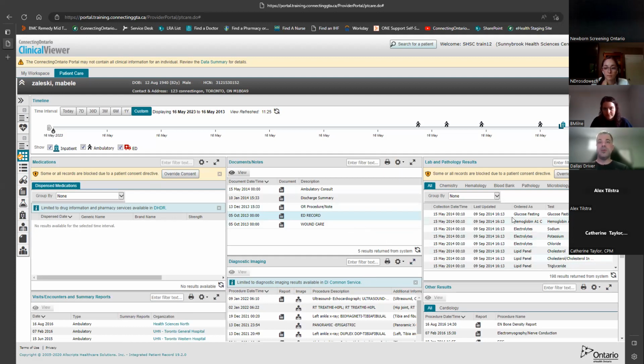There are methods for you to graph data from within OLIS. So if there's particular tests that you want to see trending on or anything like that, that capability is there. We have a number of training videos that are available for each of the portlets on our Connecting Ontario training site. And as an organization is onboarded to the clinical viewer, all of that would be made available and you'd be educated on where to get that information and how to find it.